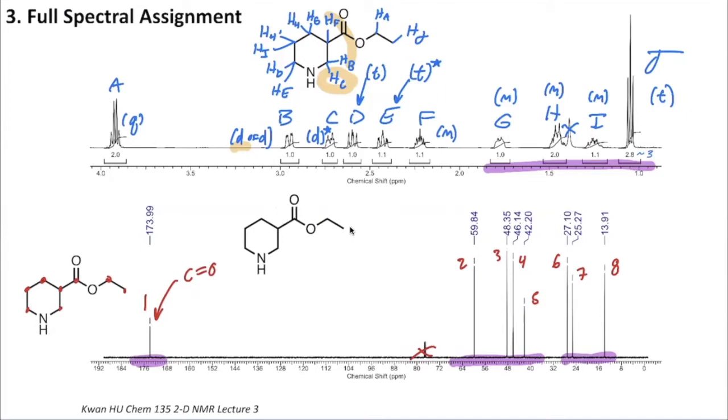And you may be looking at it and saying, Grace, I don't see any stereochemistry. Well, we have to think very carefully about this position here. That hydrogen that I've just filled in, we think is hydrogen F. And because of the hydrogen there, this CH2 that's close to other CH2 groups, this CH2 that's adjacent to the amine, and the ethyl ester here, that carbon that I will label with a red star here is a chiral center.